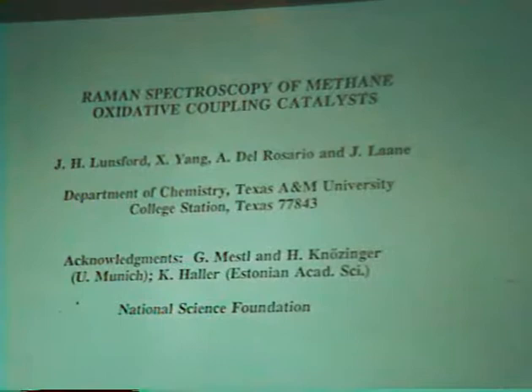Still in progress, in which we're using Raman spectroscopy. And here I've taken the liberty of expanding the scope of the conference to include other types of vibrational spectroscopy, including Raman spectroscopy, on methane oxidative coupling catalyst.